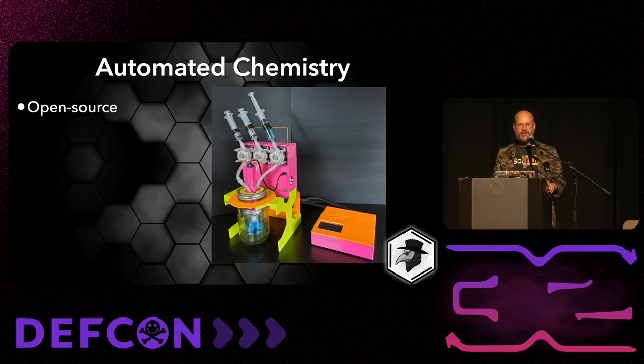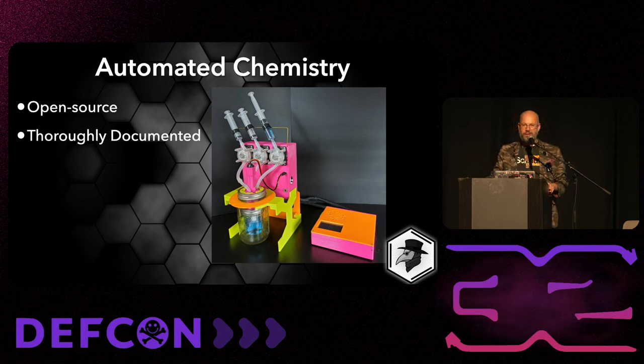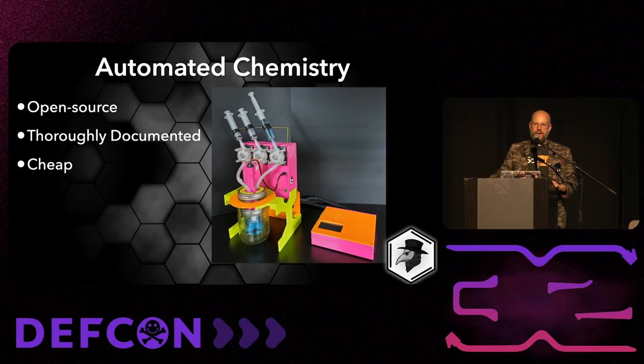This, of course, is entirely open source. You can build it yourself. In fact, that's the only way you can get it. The documentation team did a phenomenal job, and you will get a wonderful walkthrough if you decide to visit our GitHub. Remember, documentation, or it's not a project. You can make this whole thing for $300. Probably less for most of you, because you'll have a lot of this stuff lying around.